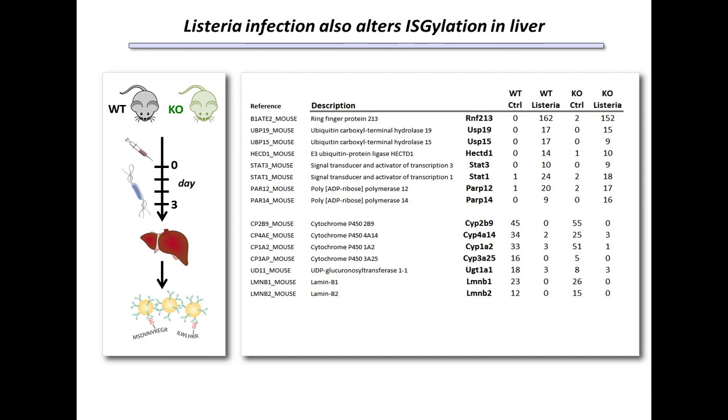Now, you can see in the context of the Listeria infection data that I showed you a moment ago that, in fact, ISG15 displays elevated levels of GG peptides on itself in the infection model, suggesting that some of the substrates that are being identified here and potentially in other experiments might also be coming from ISG15.